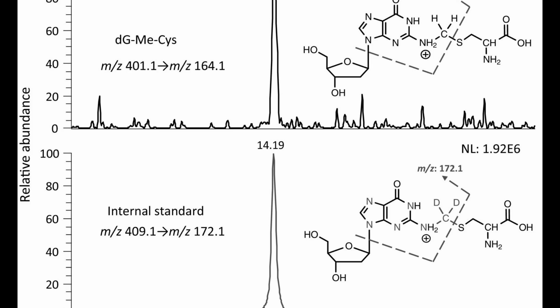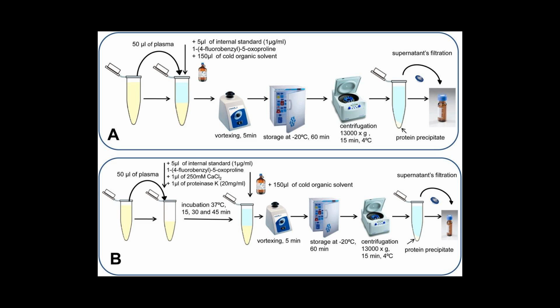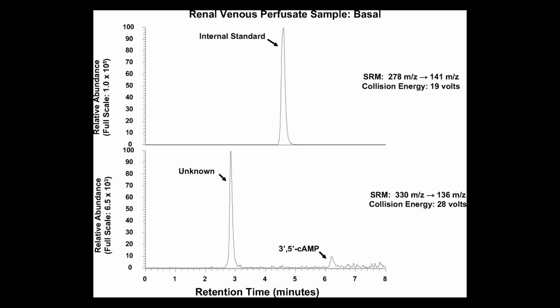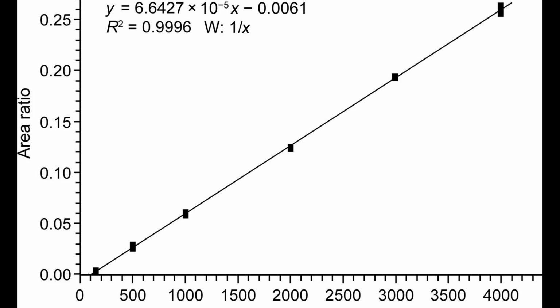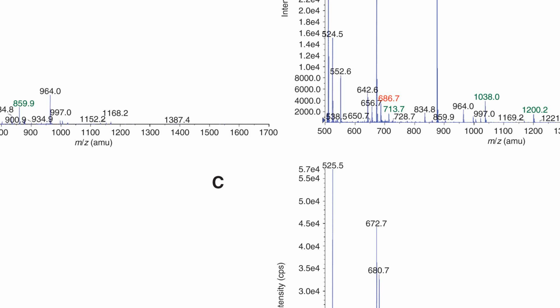In chromatography, internal standards are used to determine the concentration of other analytes by calculating response factor. The internal standard selected should again be similar to the analyte and have a similar retention time and similar derivatization. It must be stable and must not interfere with the sample components.